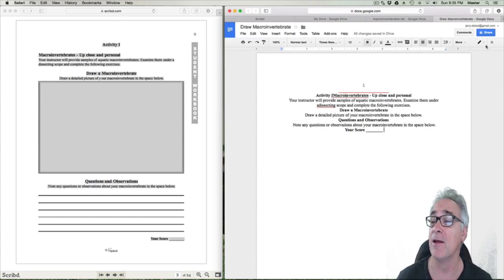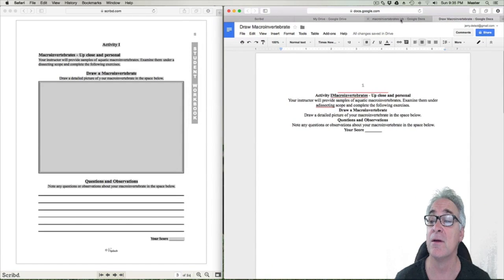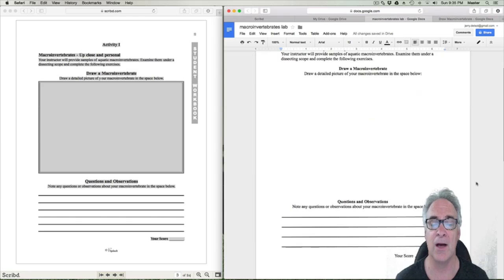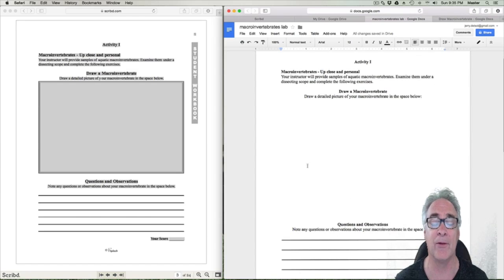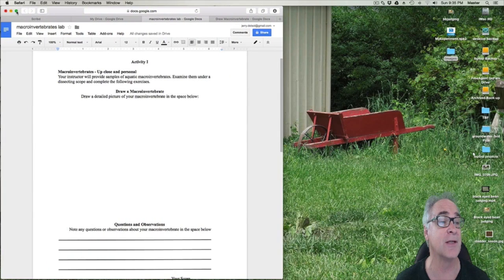You can figure that out. I'm just going to go ahead, though, and this is what the finished product looks like. I went ahead and actually took out the square box in there just because I wanted to, but that's what it all looked like. So now you're kind of ready for that. So I'm going to go ahead and close this off for now, and then I'm going to fill up the screen.